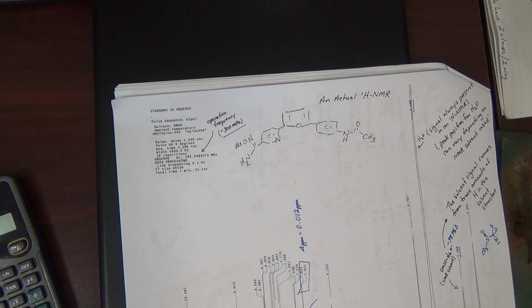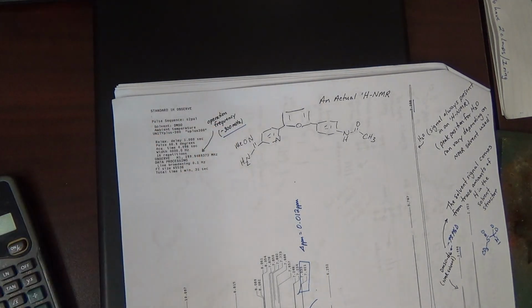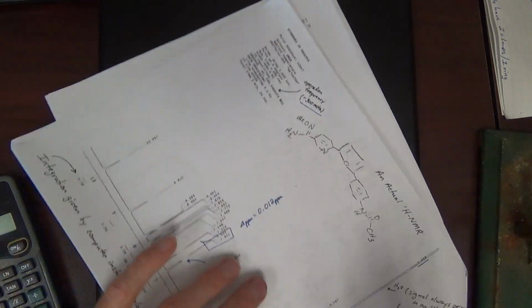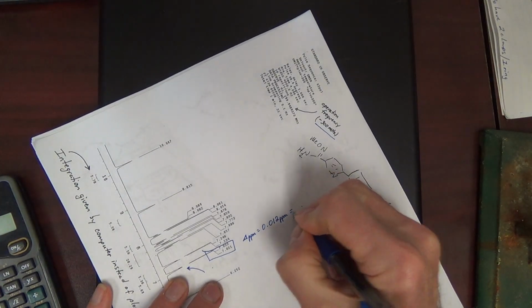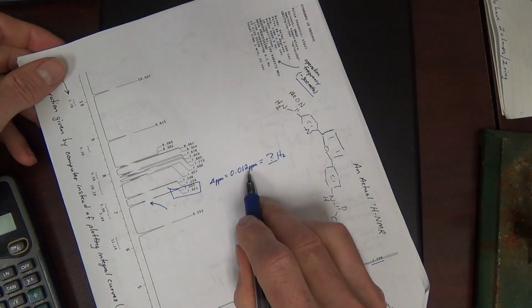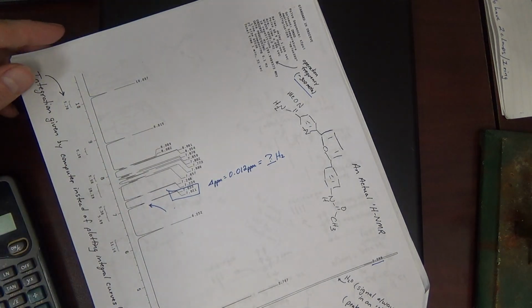If we give them in hertz, the hertz value will not change if you change the magnet size. So we give it in hertz because it's more of a constant. Basically, the job for you to do is this equals how many hertz. Convert ppm to hertz, and that will be your answer for the coupling constant of that doublet.